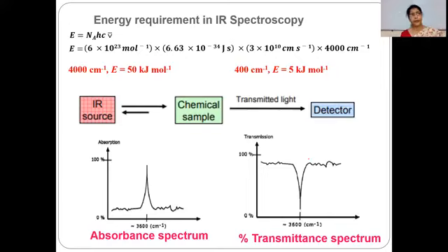In UV spectrum, generally an absorption spectrum is plotted. Absorbance is plotted against the wavelength. In place of wavelength, in IR spectrum, the wave number unit is used. Wave number can be plotted against the absorbance or against the percentage transmittance.